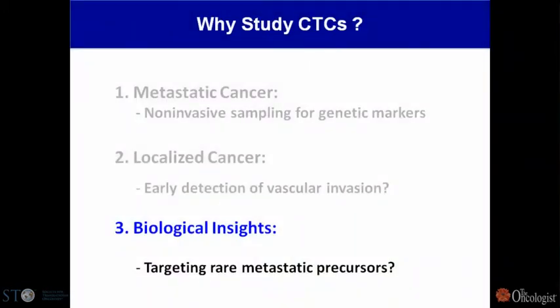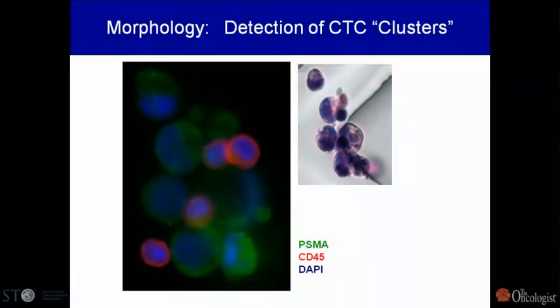Now that I have you hallucinating this great future for CTCs, let me take you over the edge. Biological insights. I'm just going to show you two things that we're focused on now, and I won't show you the third, but tell you about the third. The first is that the herringbone chip doesn't have these pillars, so it's even lower shear.